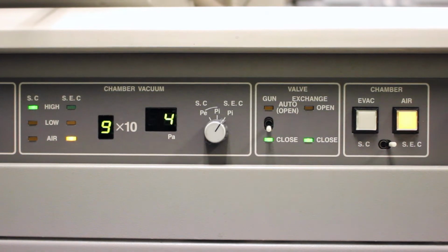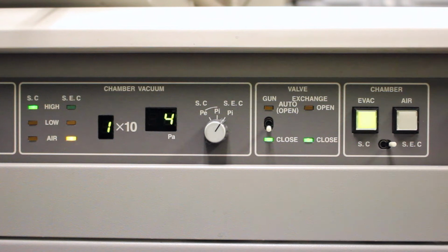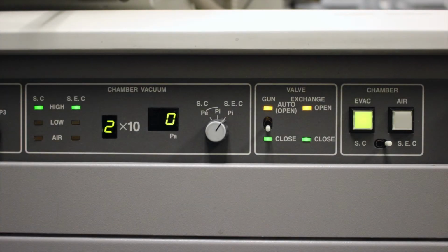To evacuate the specimen exchange chamber, hit evacuate. Starts pumping down. It'll take about 90 seconds to reach 2 Pascal, which is when you can transfer the sample holder into the chamber. This is the gate valve, which we open and close. Right now it's opening, and you can see the sample holder on the rod. We're now closing the gate valve.